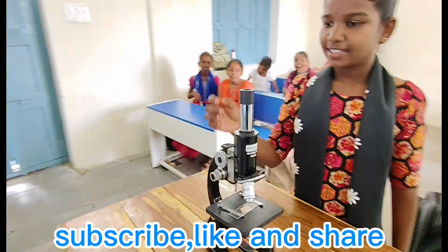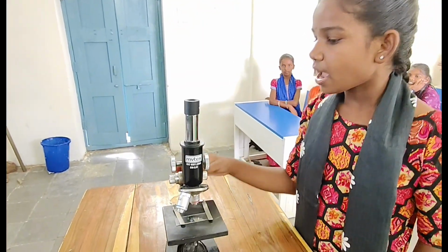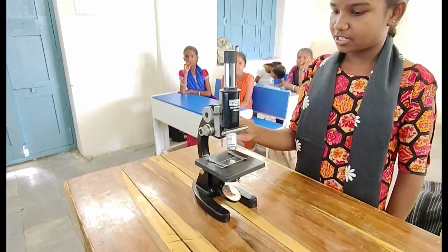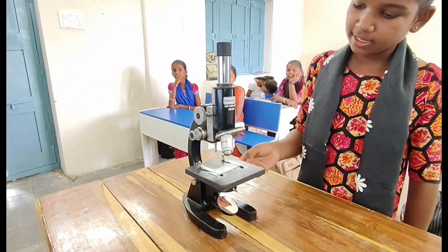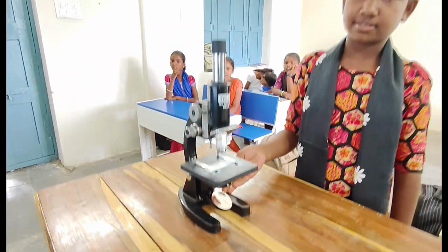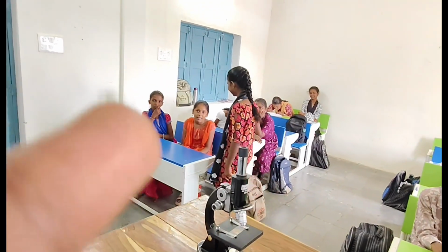Show me the parts of the microscope. This is eyepiece, tube, arm, coarse adjustment, fine adjustment, objective lens, stage, clip, slide, condenser, reflector, base. Very good. Next, Ravina, sorry.